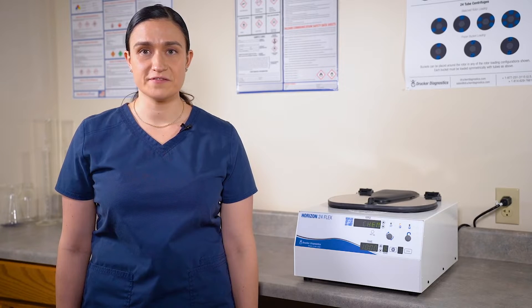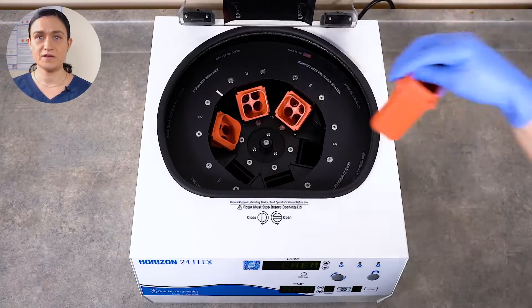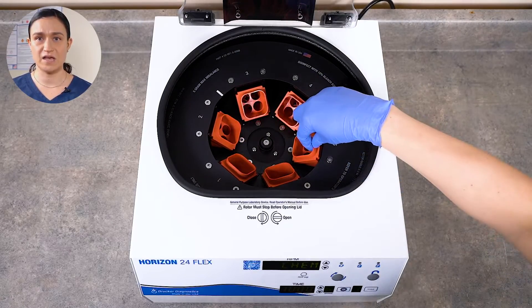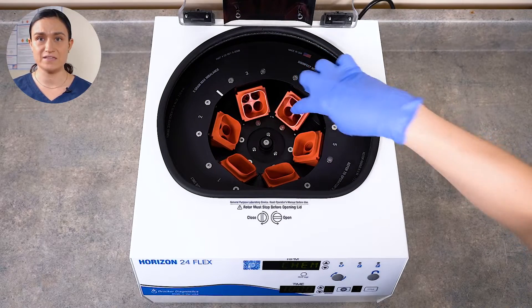Now let's look at how to load your Horizon 24-Flex and spin your first samples. Part 4: spinning samples. Before we can spin a cycle, we need to make sure that the centrifuge is correctly loaded — that means the samples it will spin are balanced. Like any centrifuge, the Horizon 24-Flex should always be run with a balanced load. This helps keep the lab safe and ensures the maximum lifespan for your centrifuge. First, make sure that all six tube holders are properly seated in the Horizon 24-Flex rotor. They do not snap into place, but should be seated one per slot in the rotor. Next, we need to balance our centrifuge. Balancing happens in two different dimensions: the tube holders must be balanced around the rotor, and the tubes need to be balanced within each tube holder.